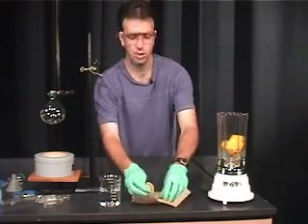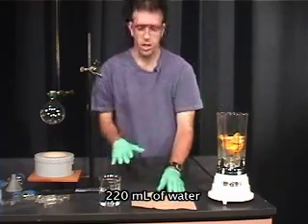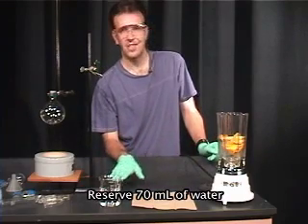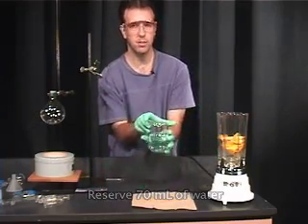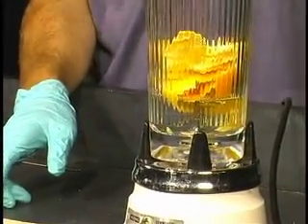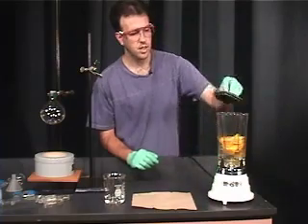The directions call for the addition of 220 milliliters of water. You don't want to add all 220 milliliters directly into the blender — you want to reserve about 70 milliliters so you can wash the blender afterwards. I'm going to add approximately 150 milliliters, reserving just a little bit of the water to wash the blender. Put the lid on.